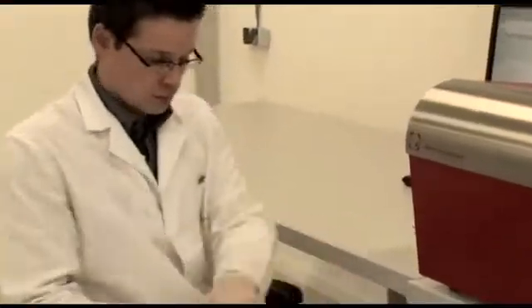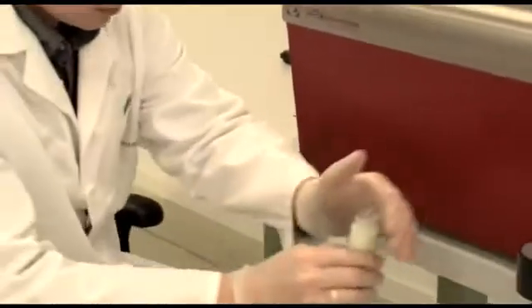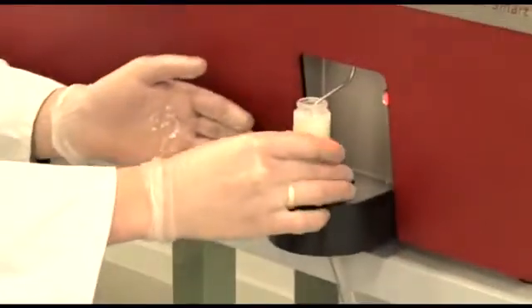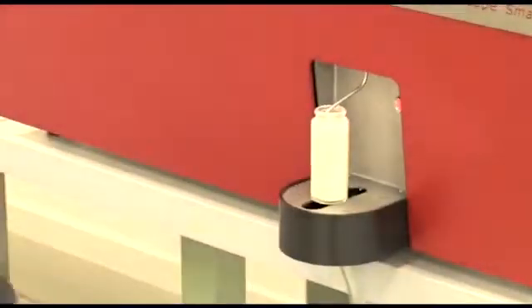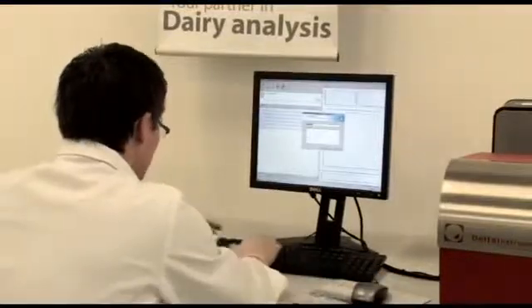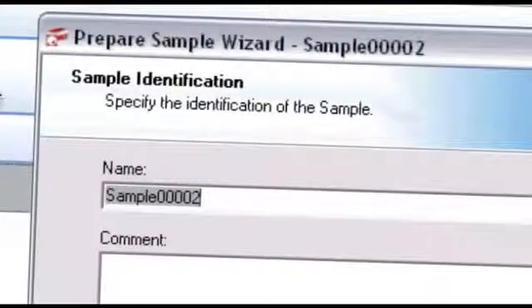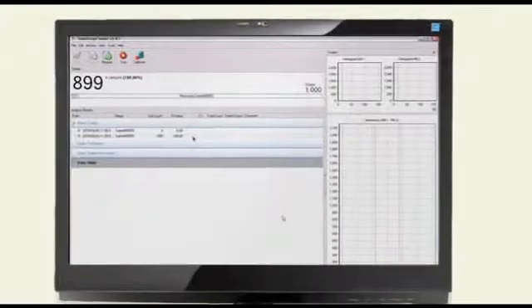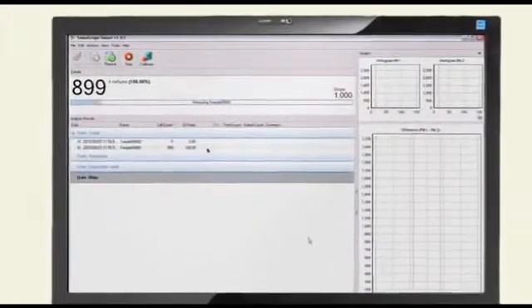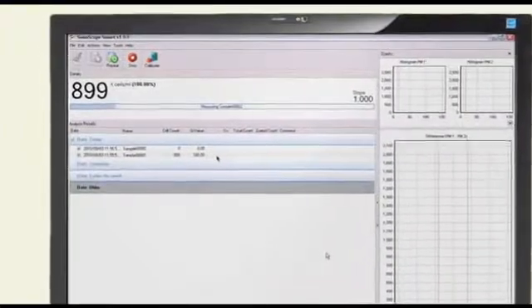For measuring a sample, a warmed up sample needs to be presented to the pipette. Now, the user selects the measure button in the software, or the red button on the right of the instrument. This opens a screen, where if you choose, you can enter the name or specific identification of the sample. When this is not chosen, the software automatically generates a sample name followed by a number.